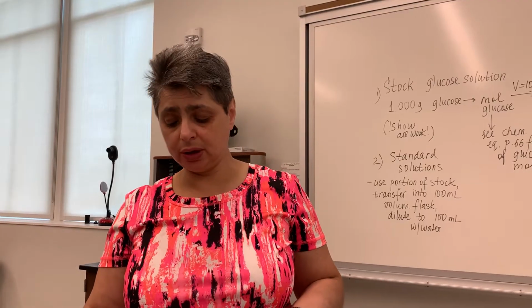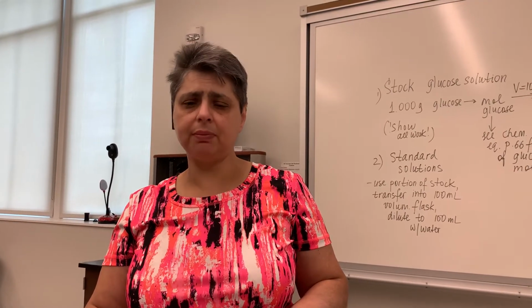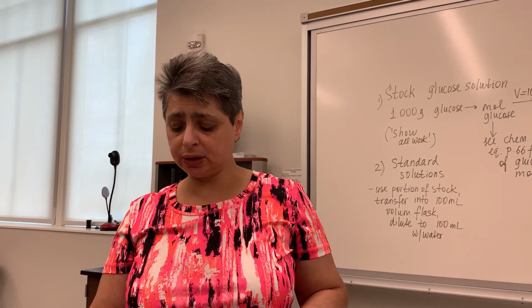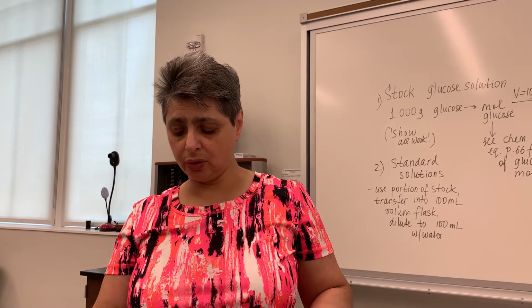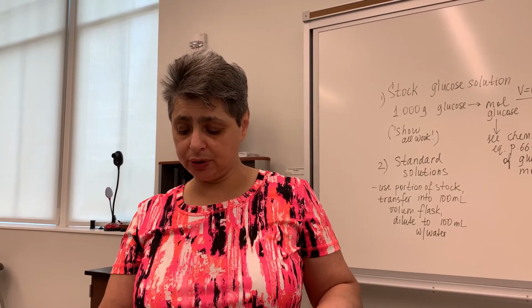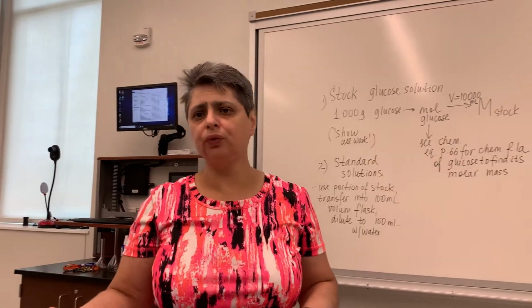Then it talks about analytical wavelength. That's irrelevant to this pre-lab, and we're not going to talk about it with regards to the pre-lab. It's going to be in lab that we'll discuss it. And then it says a set of standard solutions was prepared by taking a known volume of a stock glucose solution containing 1 gram of glucose dissolved in 100 milliliters of distilled water and diluting to 100 milliliters with distilled water. So this sentence is not worded very well, so I just wanted to unpack it for you.